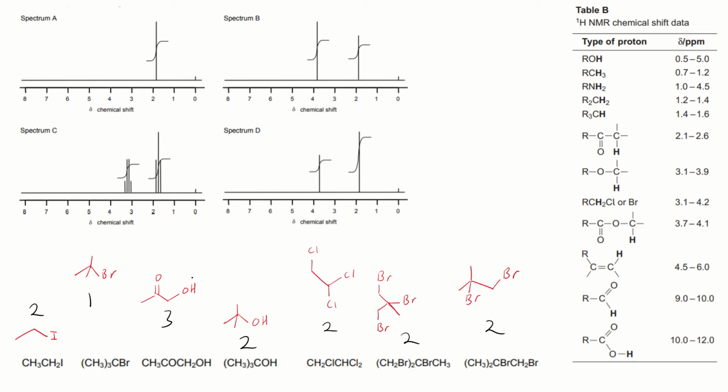With regards to the alcohols, the hydrogens on them are an environment. What you would usually see if they were present here is a little peak, and above it, this peak disappears upon the addition of a D2O shake. So I'm fairly confident none of these will probably be it. There and there. So we can see none of them.